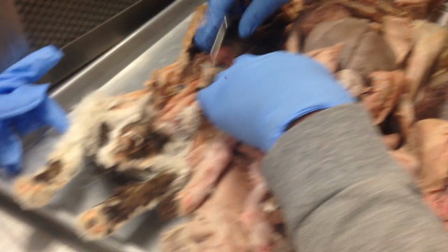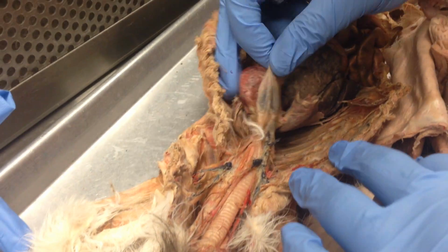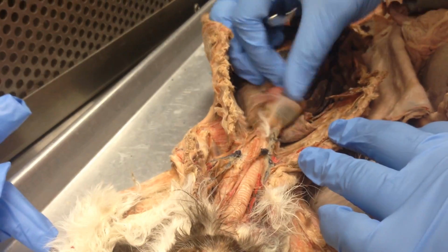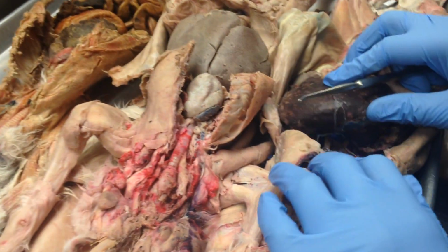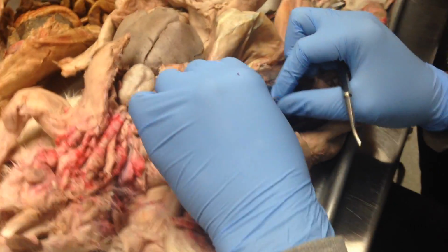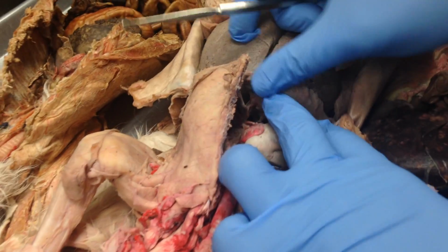Then the parietal pericardium. You can see it better on the cat, but it surrounds the heart. This white, clear layer is the parietal pericardium. All right, and then the diaphragm. The diaphragm ripped here, but I think this one has a good one, right here. That's the diaphragm.